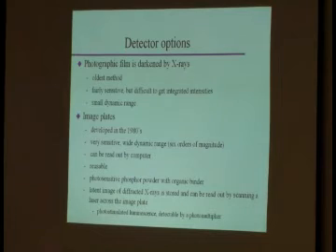So what you find in the really old literature is that people report weak, strong, medium, kind of like with IR bands, okay? It's not useful if we really want to get a crystal structure, because we need precise intensities, right? That's what gives us the type and location of atoms.